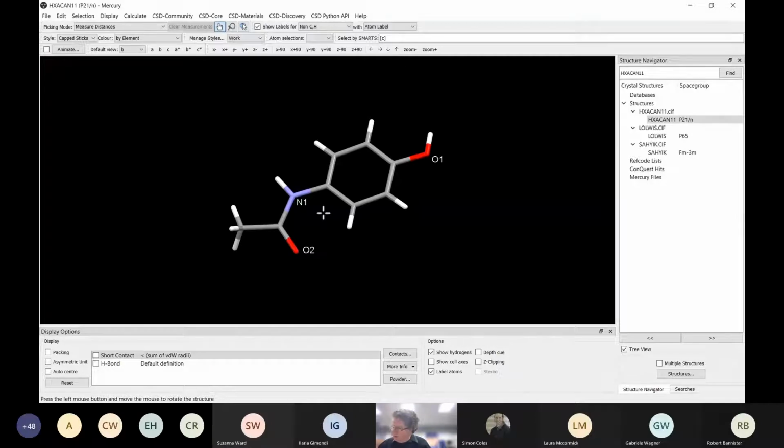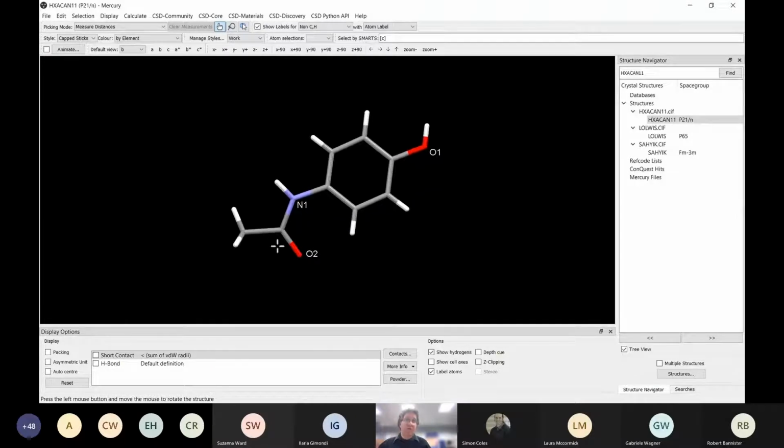Yes. But if for some reason you wanted to highlight, say, this carbon as something special, got it highlighted, so left mouse. Actually, we want to make sure we pick atoms. Then what we could do, we've got this color, so we could actually just change it. Probably red isn't the best color because that would make it similar to oxygen's. Let's go for purple. At the moment, there's nothing else.